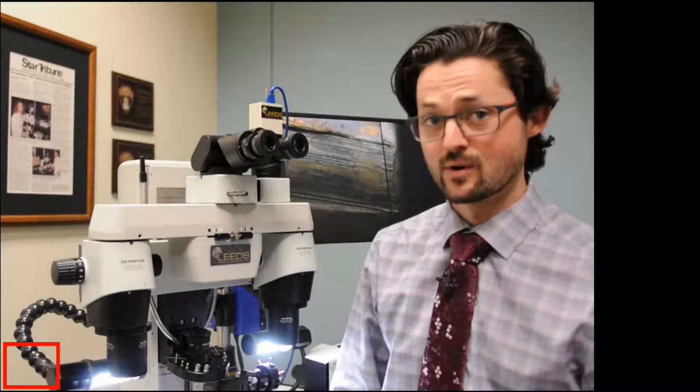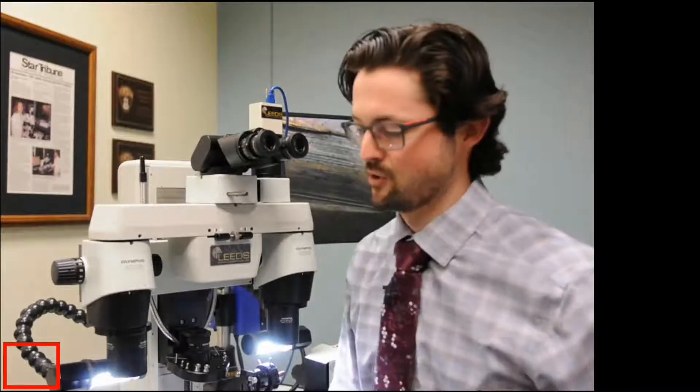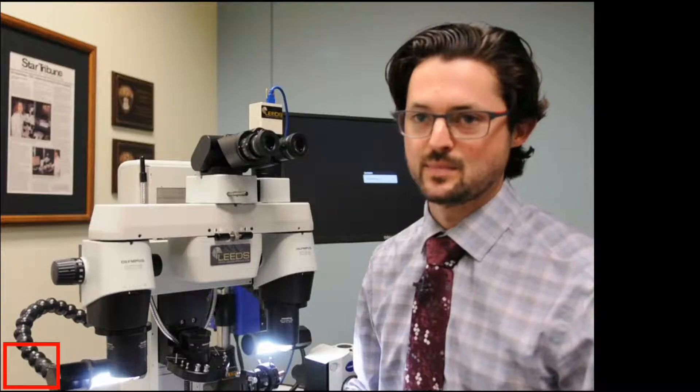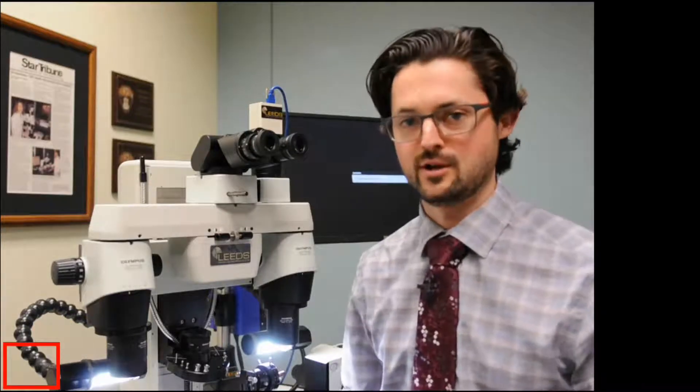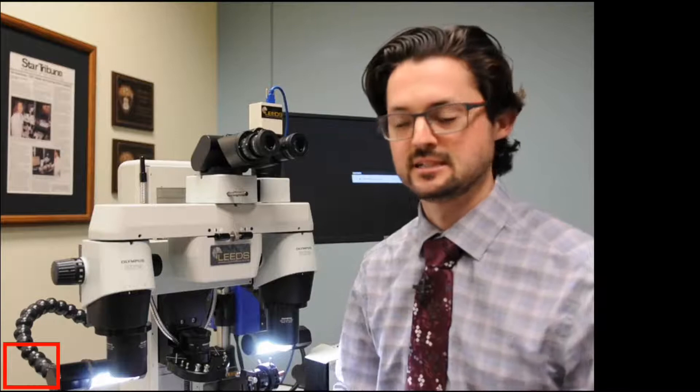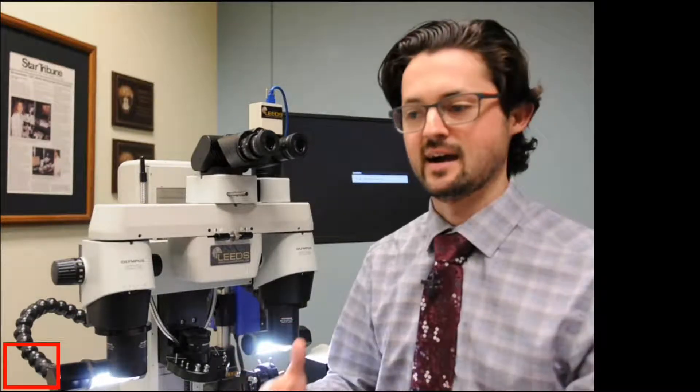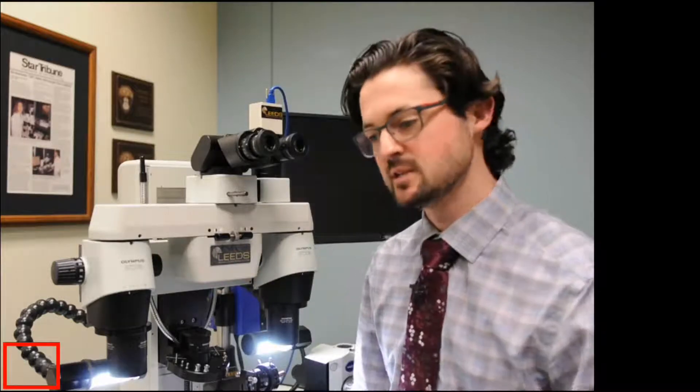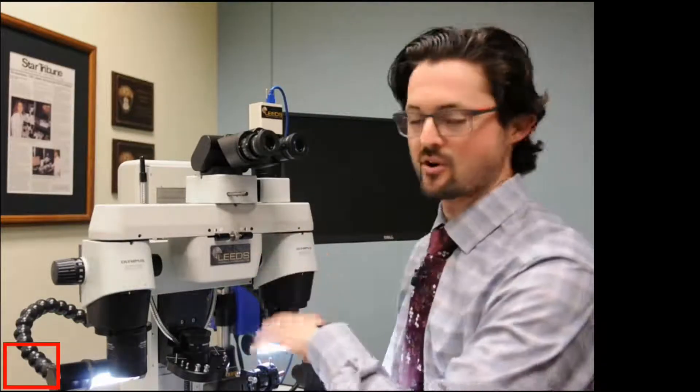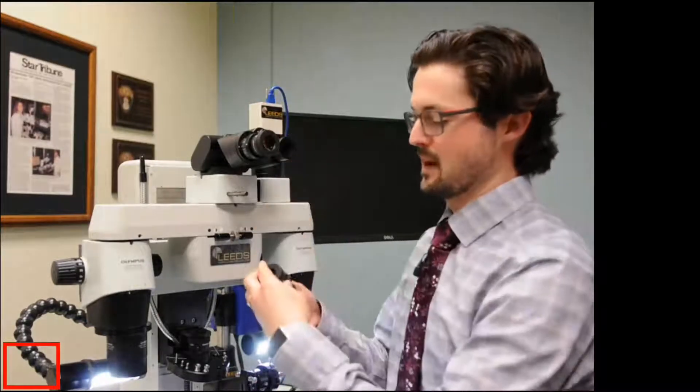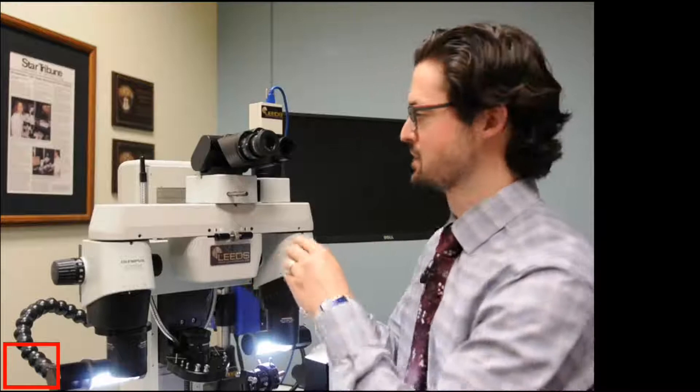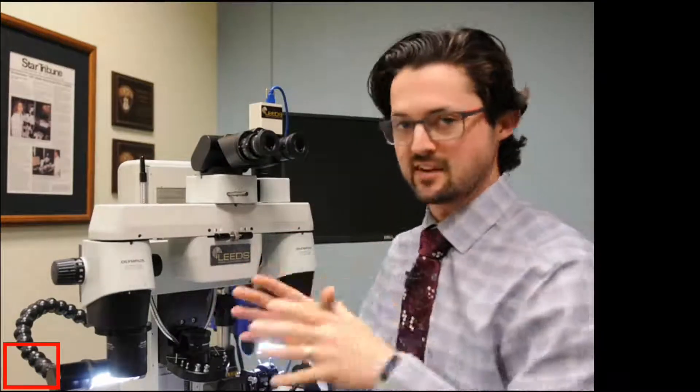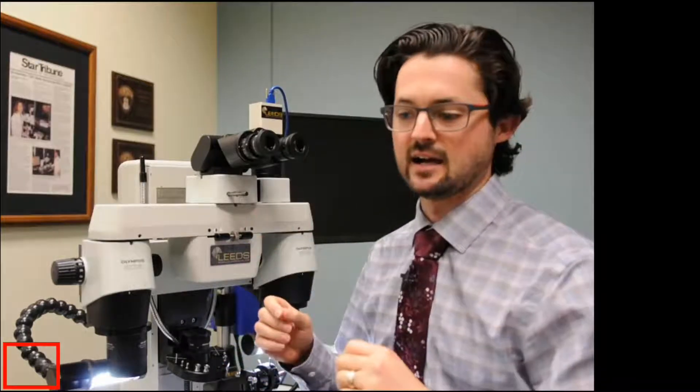So let's get started. As you can see behind me, I have one of our Leeds LCF-3 comparison scopes. And one of the biggest topics that comes up when we're training or when we're working with firearm examiners is how to get the eyepieces corrected for an individual examiner. What's really neat is we have on our microscope these printed diopter numbers. But this technique that we're going to do today really allows you to find exactly what your numbers are, and so you can dial them in.